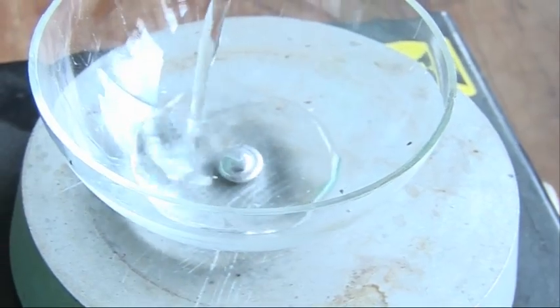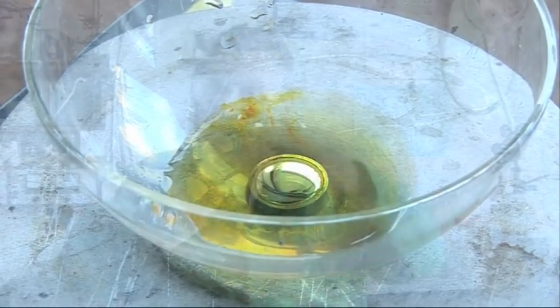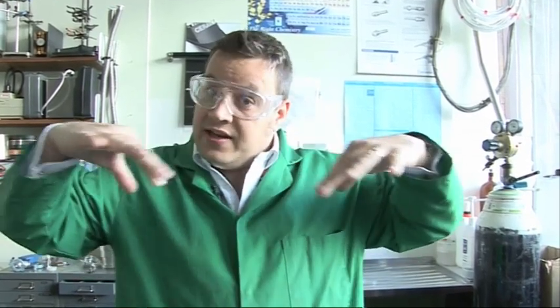What we then do is we dribble a small amount of dichromate solution in, which removes the sulfate from the surface and allows the gallium to go flat. And if we add the required amounts of dichromate to the amount of acid, then we can get the ball to flatten and come back up, flatten and come back up, so it looks like a beating heart.